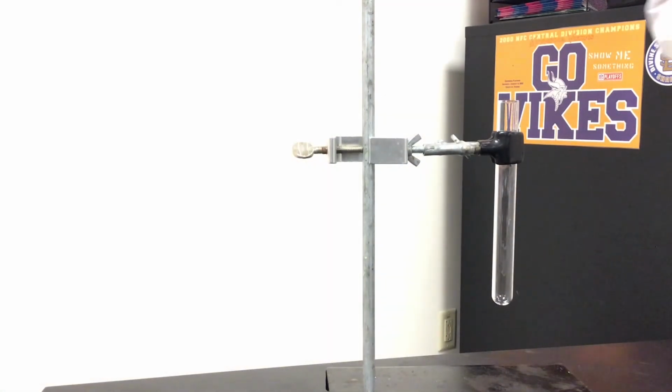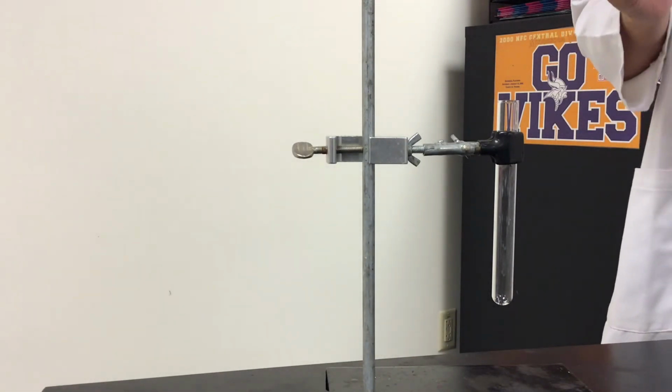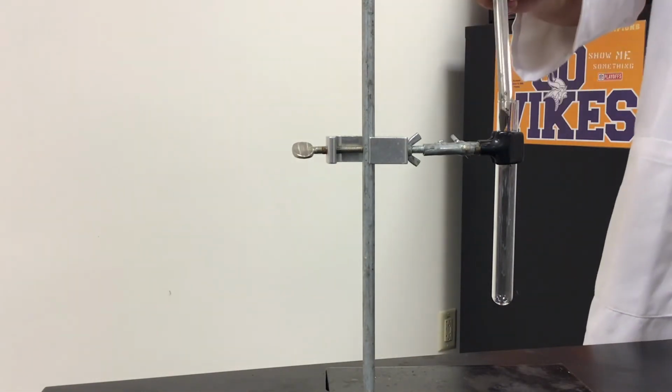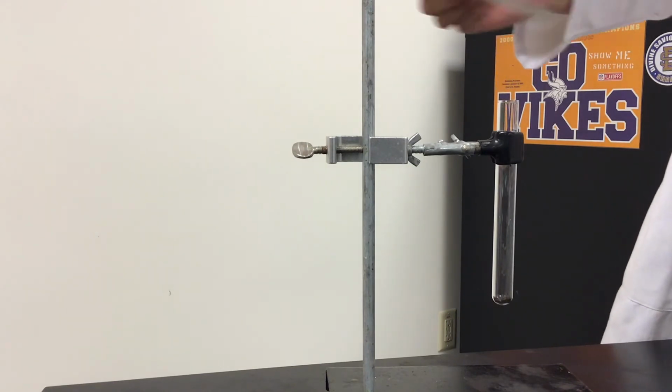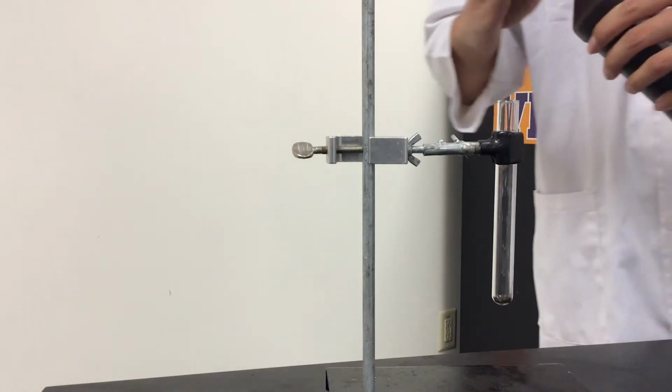I'm going to reduce the amount of manganese dioxide I put in, just a tiny bit. And instead of using 34% hydrogen peroxide, this time I'm going to use 3%. Let's see what happens this time.